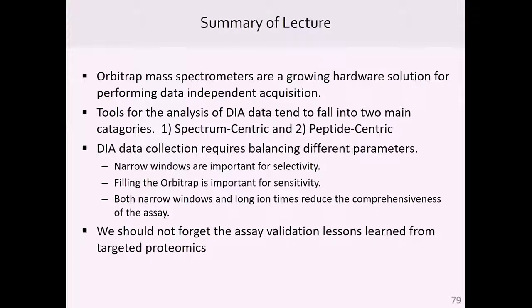Yeah, so a huge component here is automatic gain control. What people don't realize is that when you're filling with 1 million ions in an MS1 scan, you have 1 million ions before you hit space charge effects on an Orbitrap. You've got 1,000 different molecular species in a very large mass range, let's say 1,000 mass to charge. When you now fill over a 10 mass to charge window, you're filling 1 million ions in a 10 mass to charge window. You're effectively enriching the time in that narrower window.